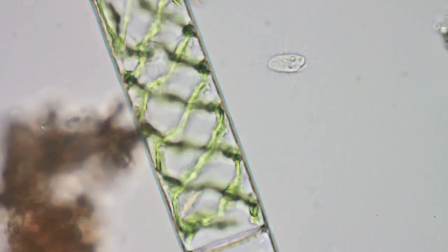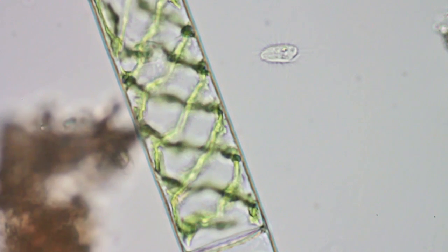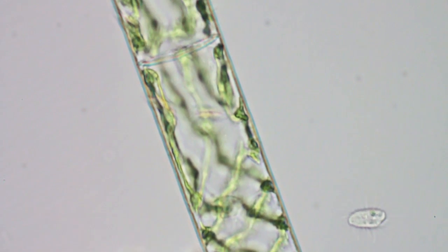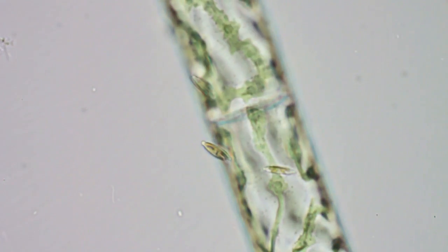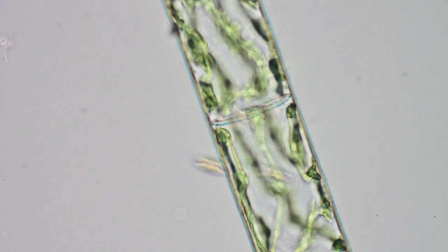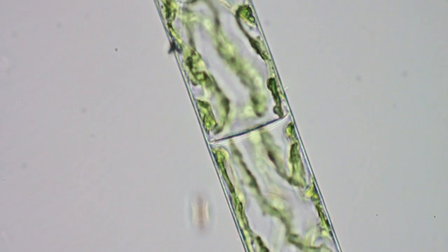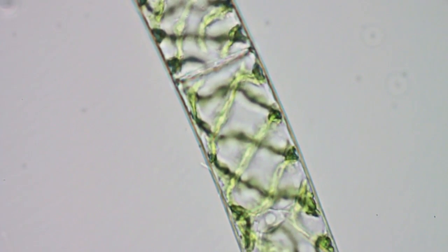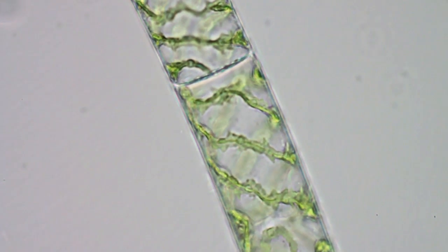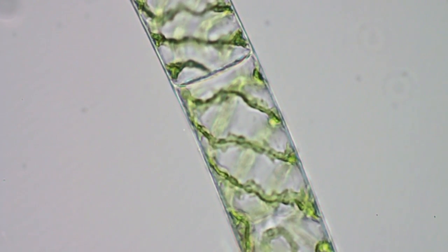There's another interesting little bug up on the right there - there's a lot of cilia. And some living diatoms waiting for a meal. You can really see the cell walls nicely in between the individual cells. In the middle of that cell there at the bottom, it looks like a nucleus - out of focus right now, but I didn't notice that before either.